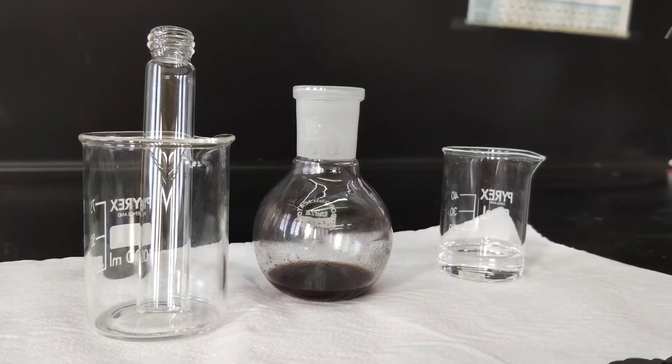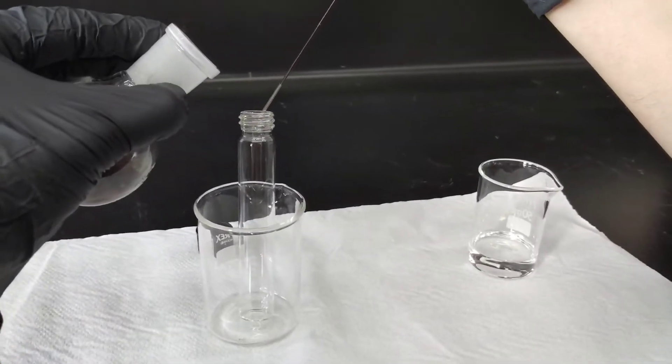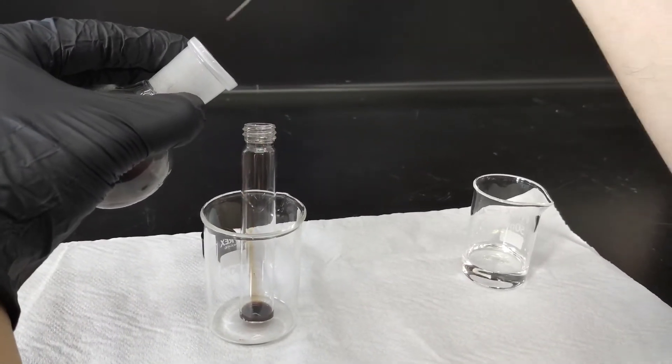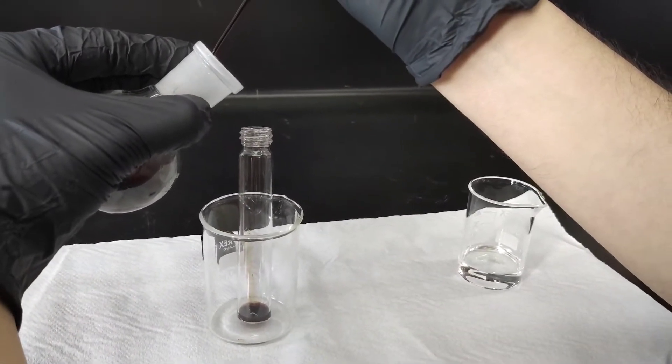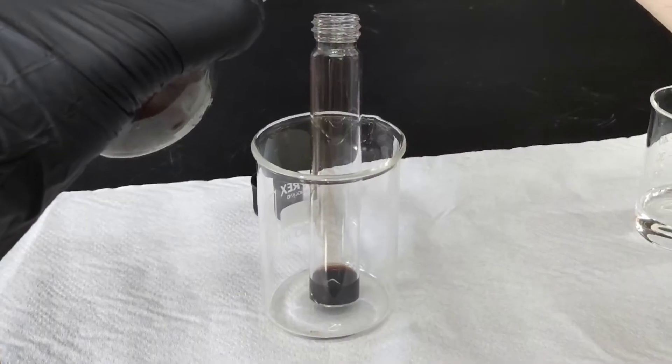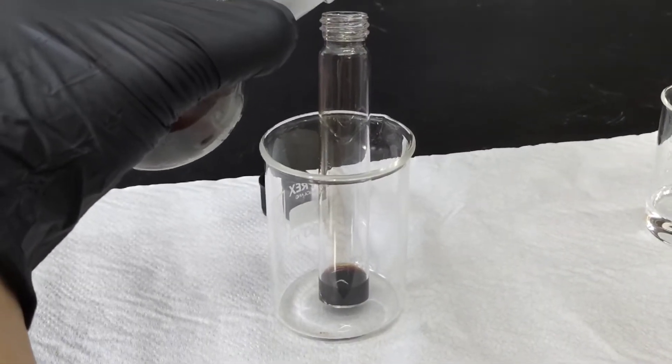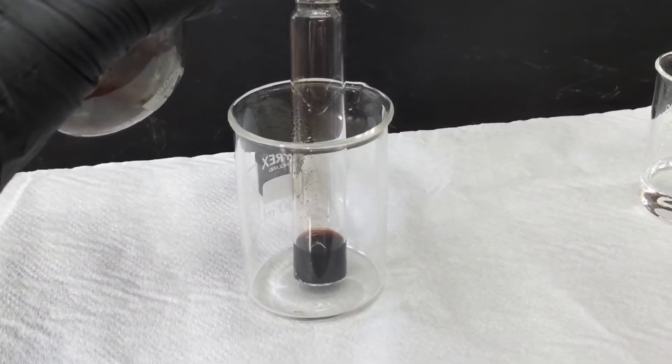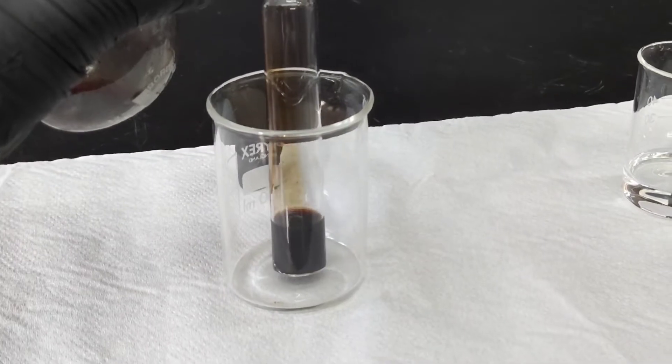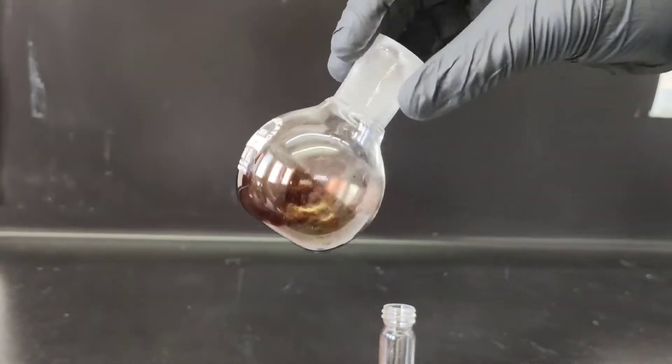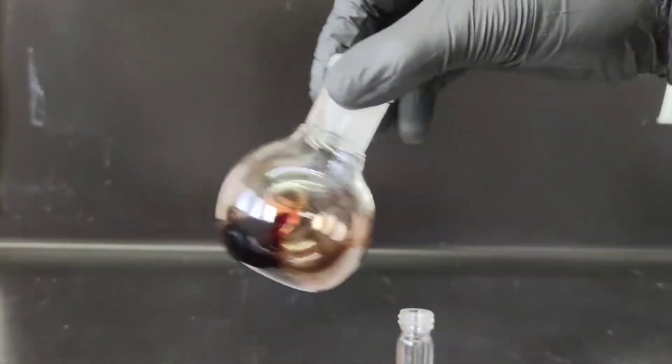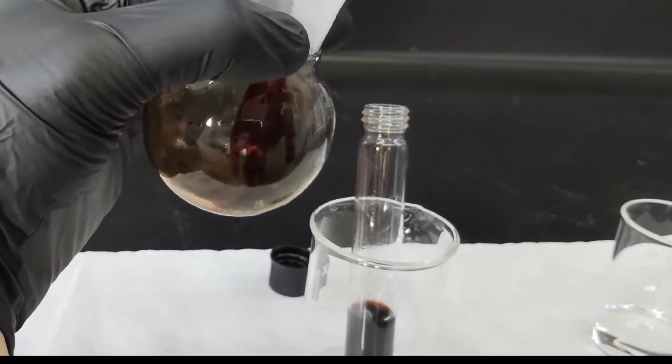What we do now is transfer the contents of the round bottom flask into a long vial using a pasteur pipette and slowly pour the contents. You can see there's already solid material but we are going to re-dissolve that with some more DCM in order to achieve a slower recrystallization.